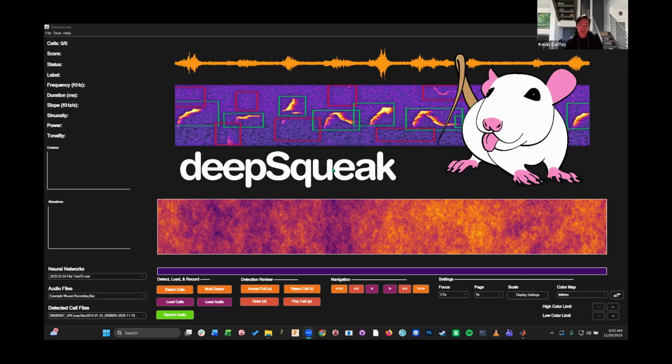So I thought I'd do something today, which is generally ill-advised, and that's to try to give a live software demo and show off how quick and easy it is to use DeepSqueak to analyze a data set of vocalizations. I'll just jump right into it.